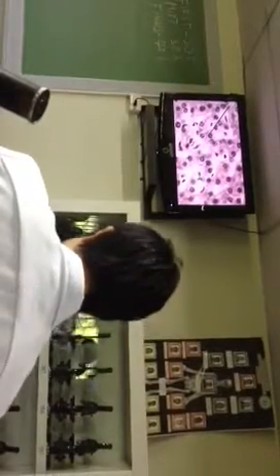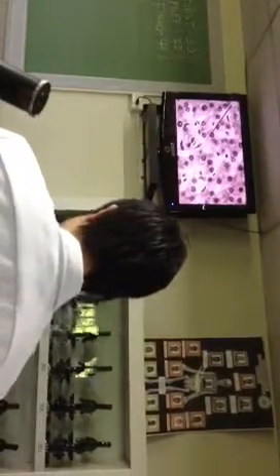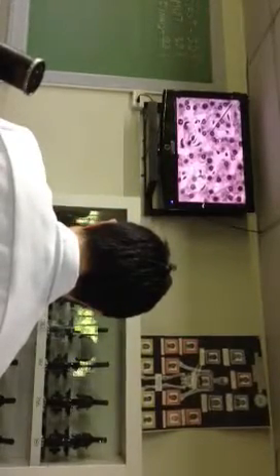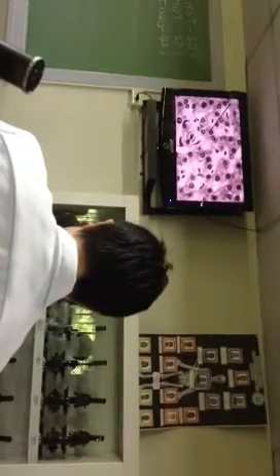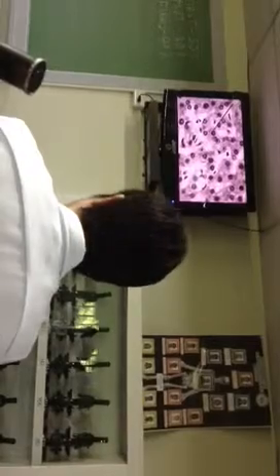So again, what is the parenchyma? What is the organ? Liver. Shape? Say it louder. Very good. Arrangement? Very good. Number of nucleus? Alright. And what is the location of the nucleus? Very good. Let's move on to the next slide.